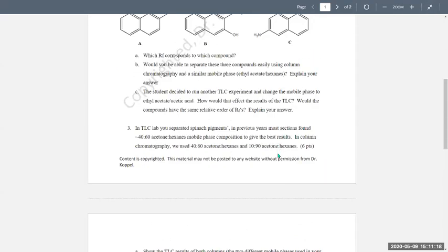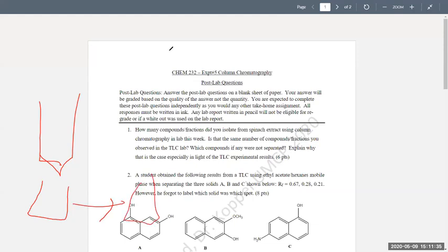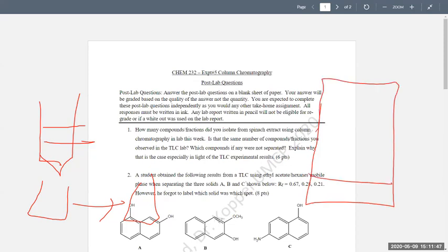And again, remember that in experiment 5, similar to experiment 3, you did column chromatography as the basis for separation. So you were judging when to separate your compounds. You were judging when to move on to collect another one. Like, you were judging where your layers were, just like experiment 3 with extraction. So yes, there is a little bit of human error. And then from how you extracted, you were assessing how good a separation you got.